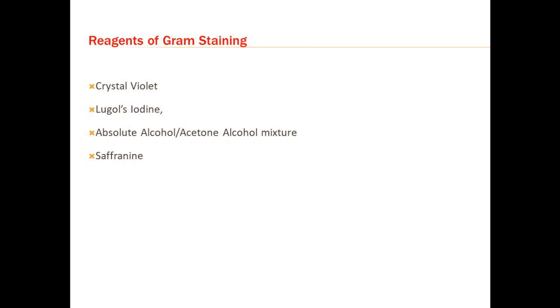And the fourth is safranin, called the counter stain. These four reagents are used in the same sequential order in the Gram staining procedure.